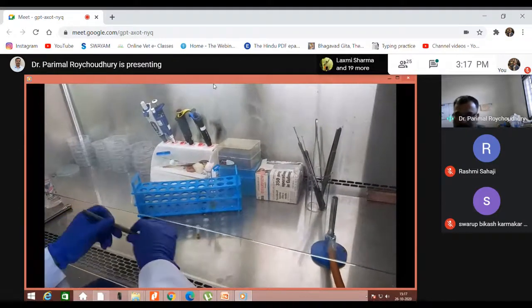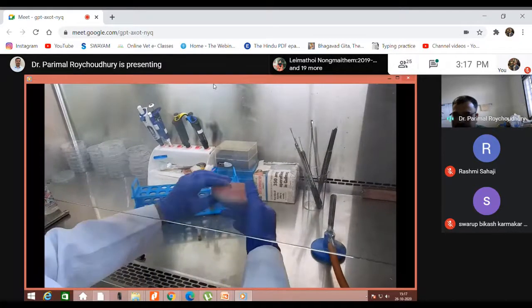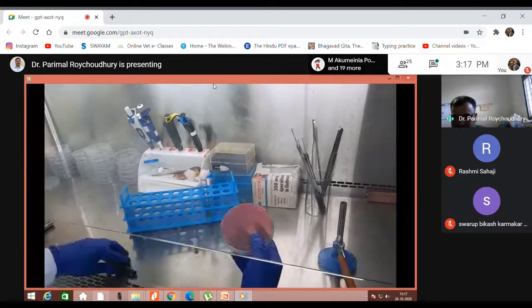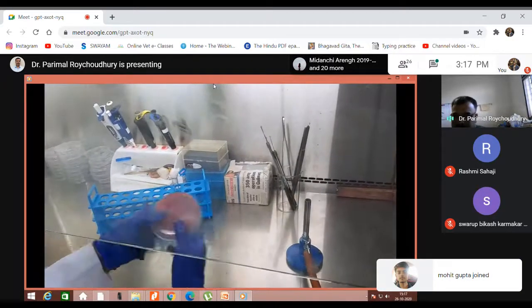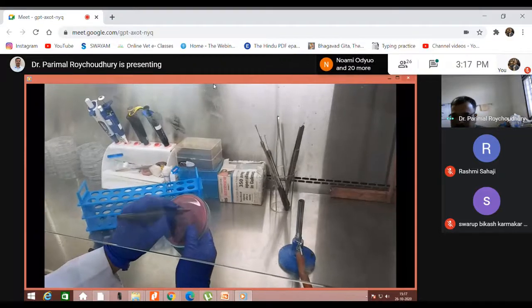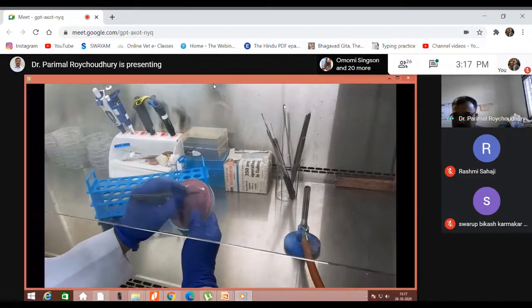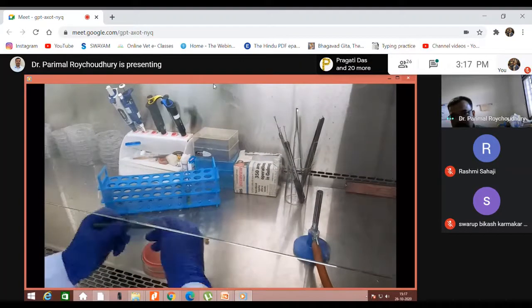At the same time, we take a sterile MLA plate, because it is a stool sample. We prefer MacConkey's lactose agar. It was prepared yesterday, and we give the same marking as the E13, and we write today's date. Today is 26. Then we will give you the demonstration.